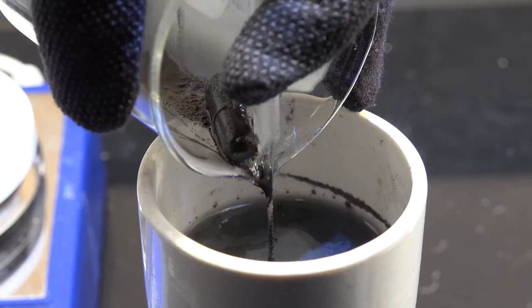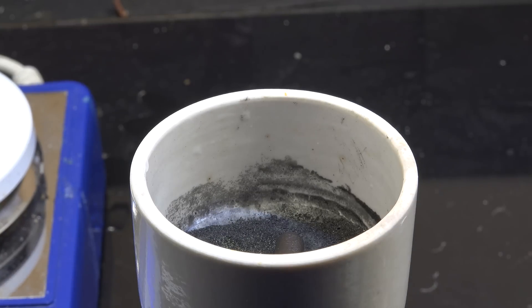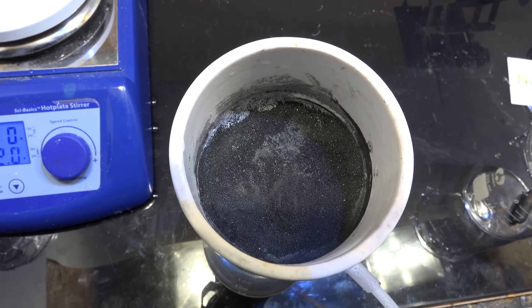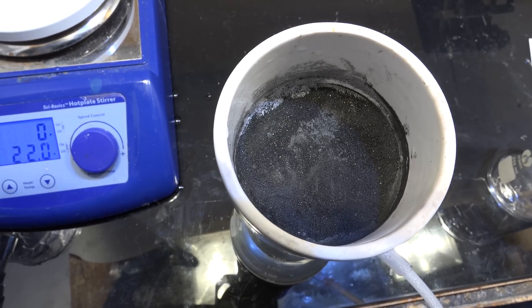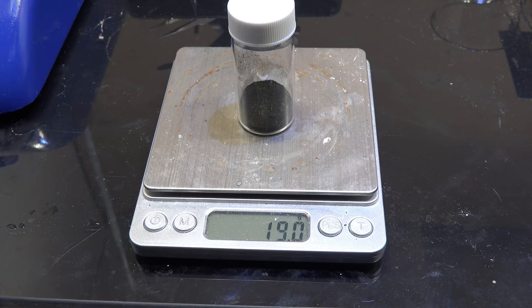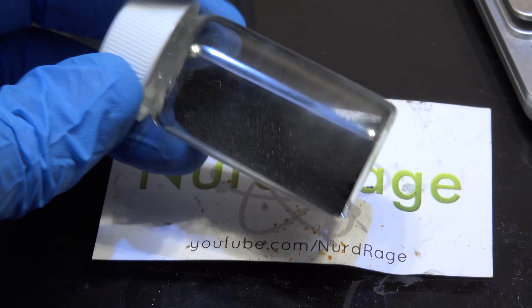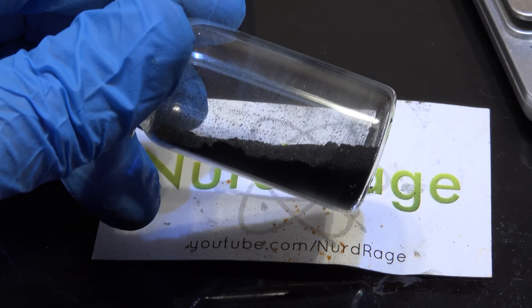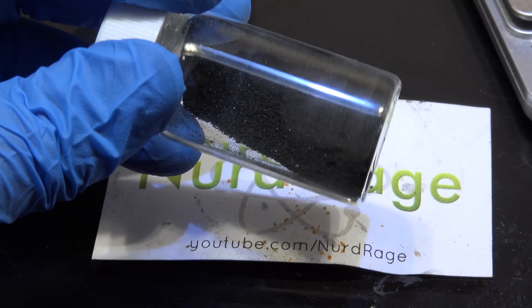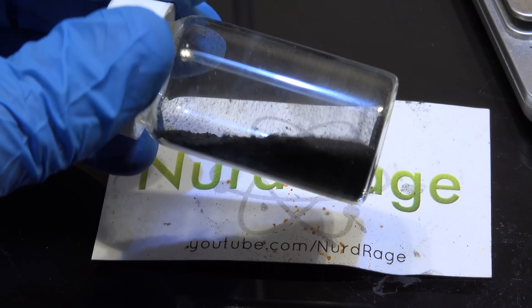At the final run, dump the whole contents onto the filter paper and remove the stir bar if you used one. Then allow the residue to completely dry under the air current of the vacuum filter. Here is the residue as it's drying — looks like dirt, but it's extremely valuable dirt. Weigh out the vial and transfer the residue to it. Looks like we have collected a total of 2.4 g of burned and washed platinum-rich chemical waste. At this point we can't even call it chemical waste anymore — it's more of an ultra-high-grade platinum ore. Most of the troublesome organic waste and soluble salts have been removed. We can recover platinum from this the same way we recover platinum from jewelry or catalytic converters.